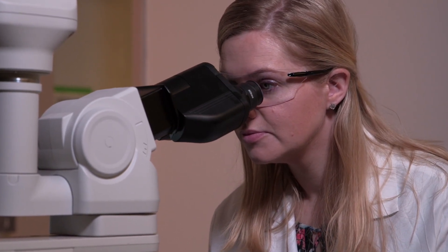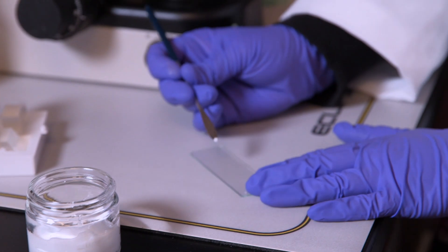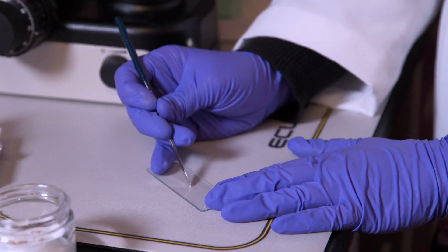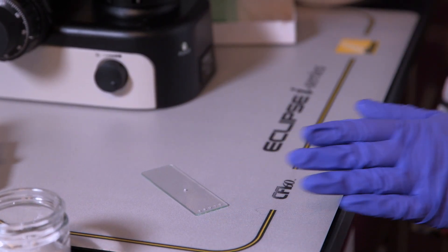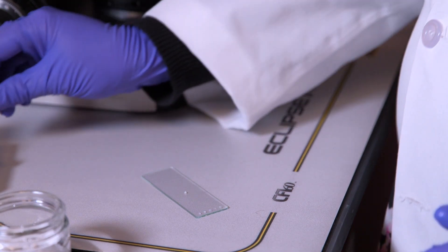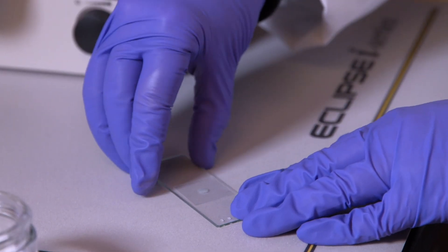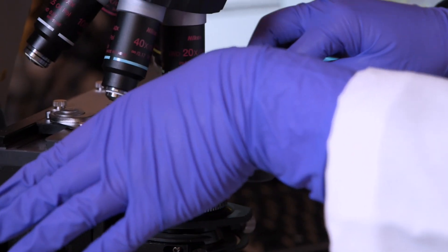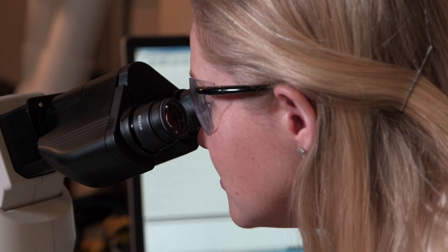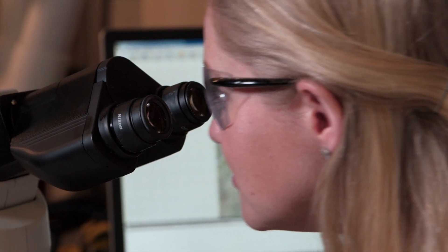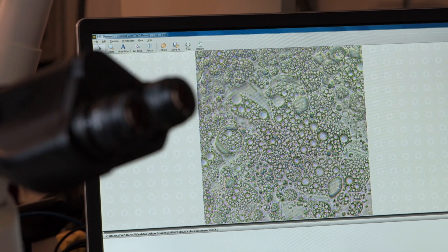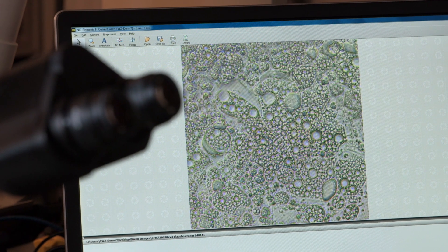One aspect of analysis is the microscopic evaluation of the creams. To evaluate microstructure, a small amount of the formulation is applied to a microscope slide and a cover slip is added while pressing gently. The formulation elements that can be elucidated using bright-field microscopy include multi-phase structures, aggregates, oil droplet size and distribution, and API crystallinity.